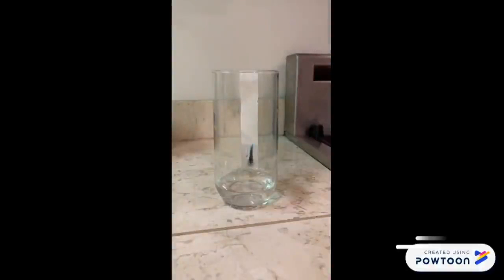So this is a time lapse of the paper chromatography. Again, this is a fun experiment that you can try at home without having to buy any materials. As you can see, the salt solution moves up the chromatography paper by capillary action, and as it passes the black dot, it carries the ink with it and separates it in the process. The black ink separates into blue and red primarily. The blue travels the fastest and the farthest, while the red, which shows up as brown with pink traces, though it does travel a little, takes a lot longer to do so and doesn't travel as far.